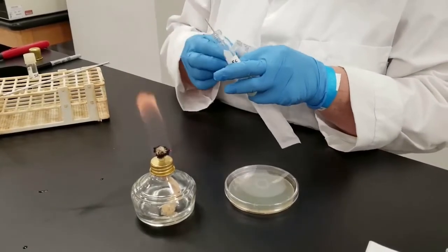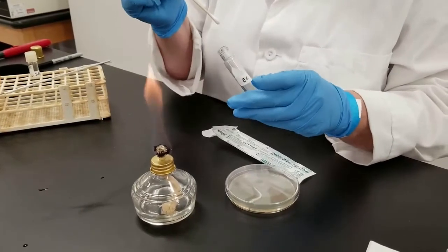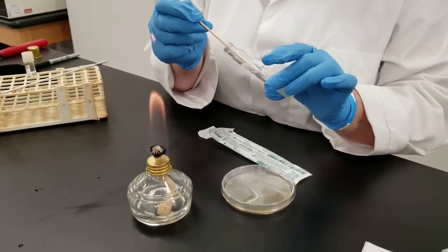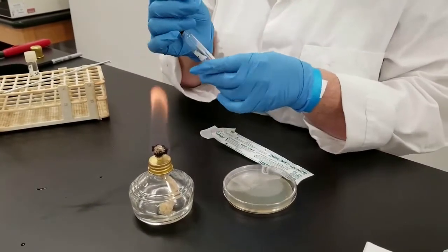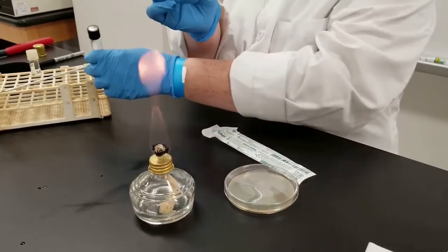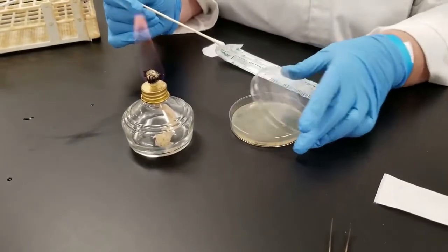The cultures have been grown in a liquid medium. So what we're going to do, flame the loop. We have a cotton-tipped applicator. Basically looks like a fancy Q-tip. I'm just going to dip it into the tube, just very gently, squeeze off excess. Flame our tube. Put the tube aside.